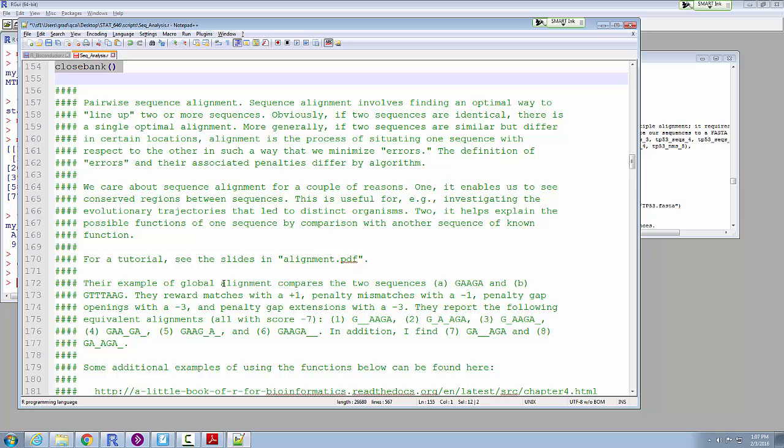What you want to do is map all those reads. Here's your pile of all these short little reads, sequences, and then you have the total genome for the mouse. I know that if you start at chromosome 1 and just start reading, this is what it is for a mouse. So here's one of my little reads, a short little sequence. What I need to do is find out where I put that in the genome. Did this come from gene RPOB or did it come from some other gene?